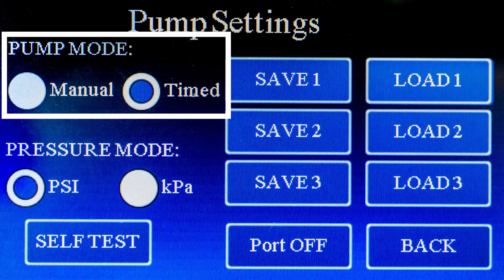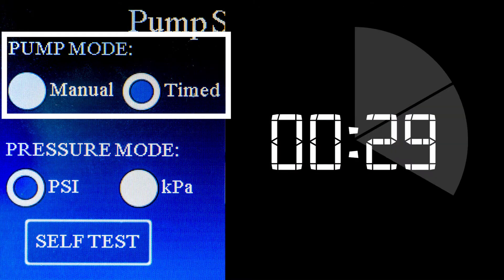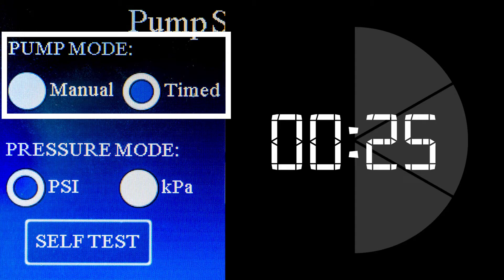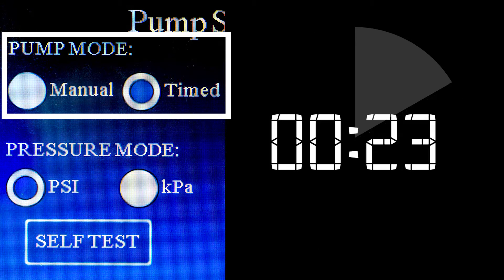In timed mode, an electronic timer controls the duration that the pressure valve stays open. The inject button, foot switch, or 5 volt TTL trigger serves only to start the timer.